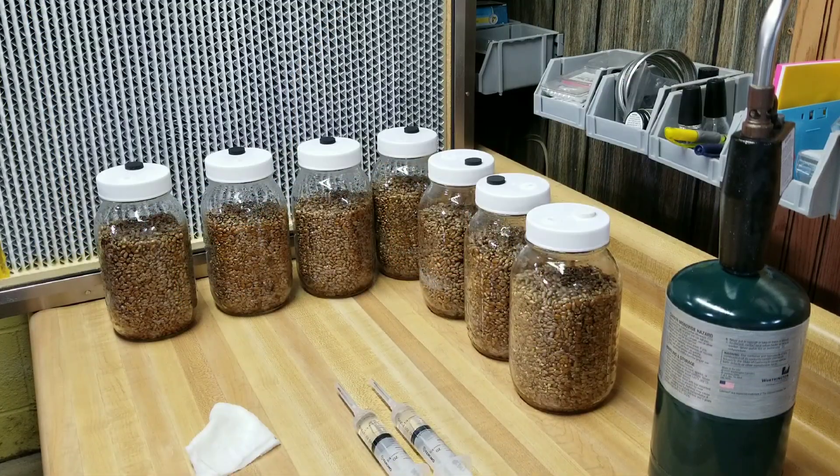I haven't done my agar wedges yet - for those I actually work directly in front of the laminar flow hood instead of sideways. Once I get my mycelium in there, I give these jars a shake in front of the flow hood. Check your lids first - make sure they're nice and tight, because it is typical for lids to loosen up a little in the pressure cooking process. If you don't have a flow hood you can just do this in a still air box.